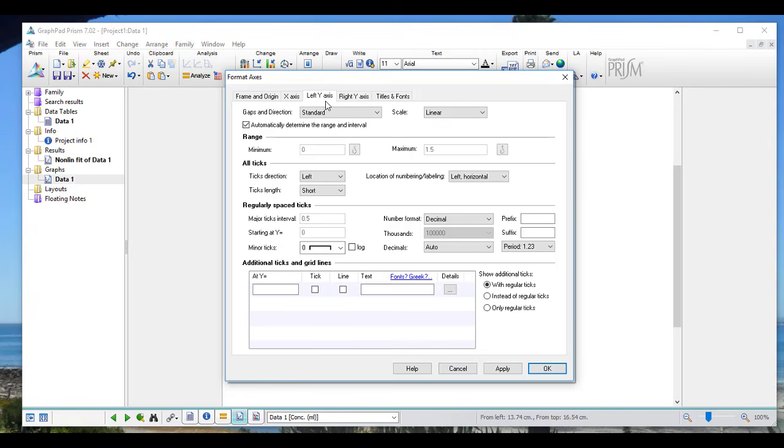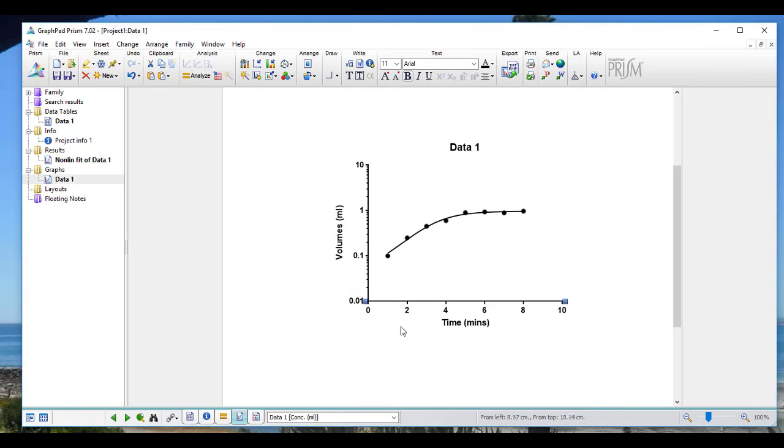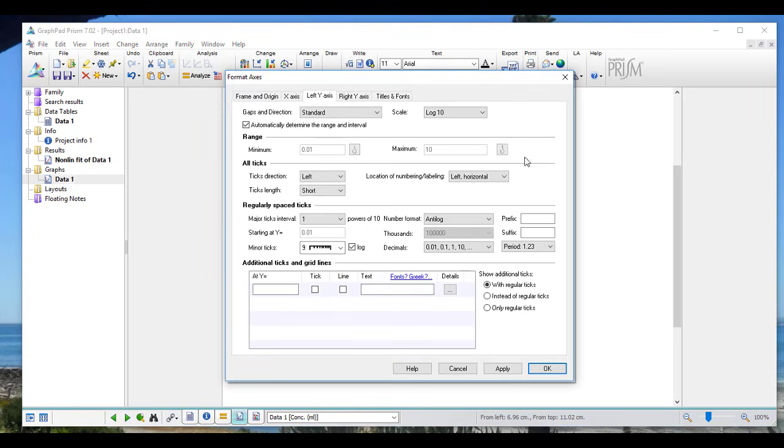If you are doing MGC, the graph that you will be generating in Practical 5 requires that one axis uses the log 10 scale. So here is the y-axis. The default is linear, but by selecting log 10 and clicking OK, you can see that the y-axis scale is now in log 10. But this is not relevant here, so I'll change it back.